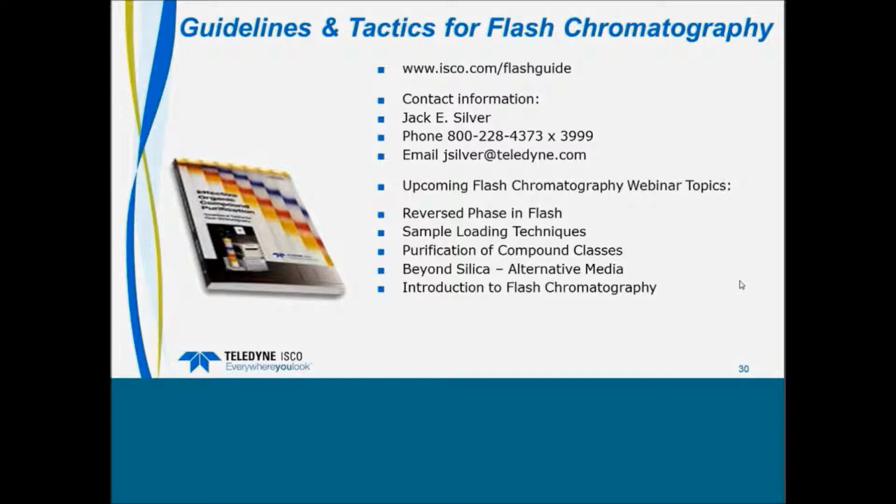The ion exchange columns are reusable, and you can use them many times if one takes a little bit of care of them. Likewise, the C18 and diol columns are also reusable. I find that the alumina and the silica columns do tend to have a little bit more unretained material on those, despite the use of wide polarity range chromatography. So for those columns, I tend to use them one time, but they're also relatively inexpensive compared to the other columns too.